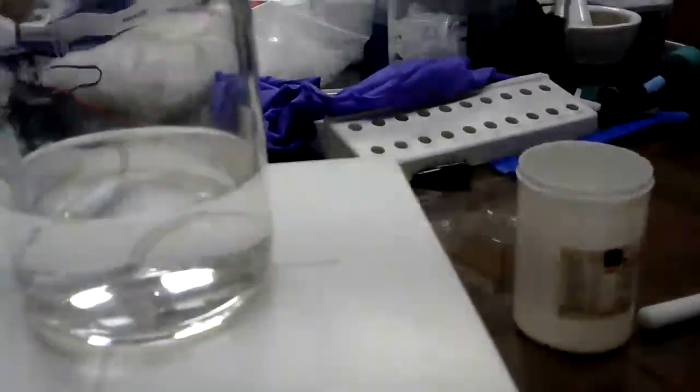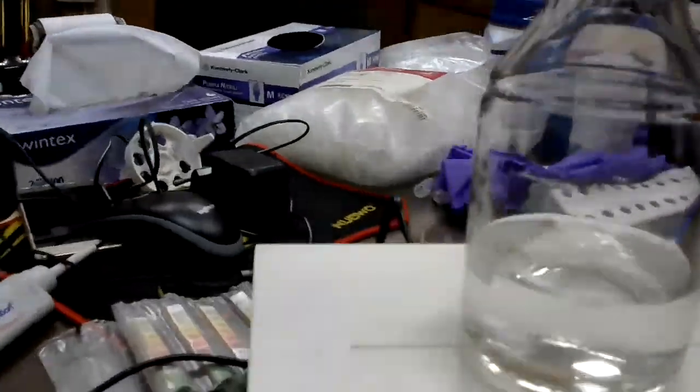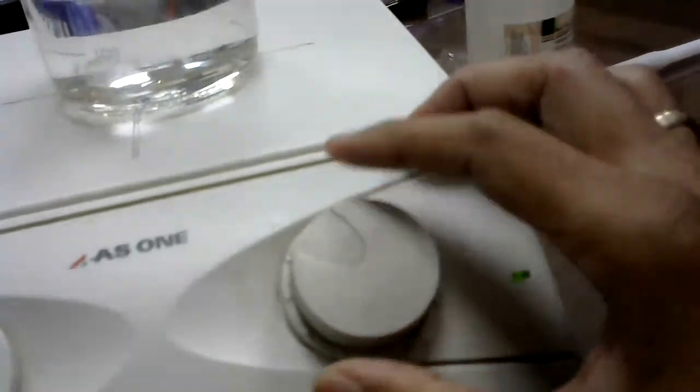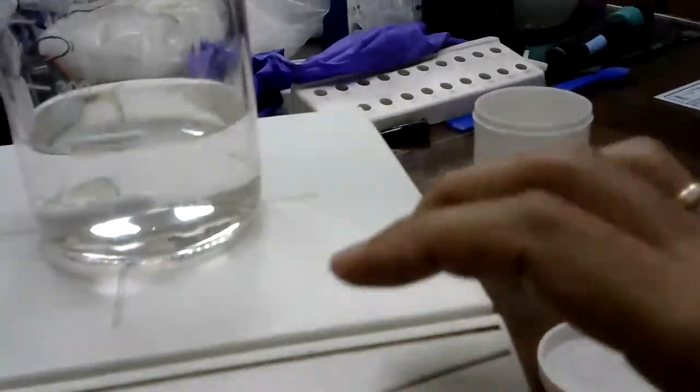You see, this has started. Oh, no. This is acetic acid solution. And you see the knob. I have switched it off. Okay.